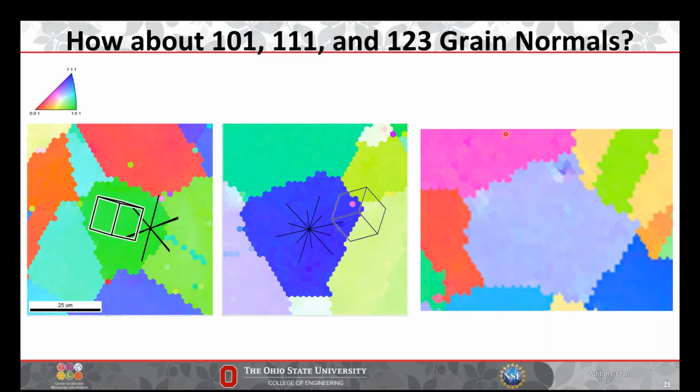And so I've also done this because we check the other grain orientations to see what type of deformation modes we have active there. That's a little beyond the scope of the talk. But in terms of physically how we're doing this, it's the same, right? We can draw a cube and the traces of, in this case, 011 type planes, and then do this for, say, the 101 type grains. And that might seem intuitive.